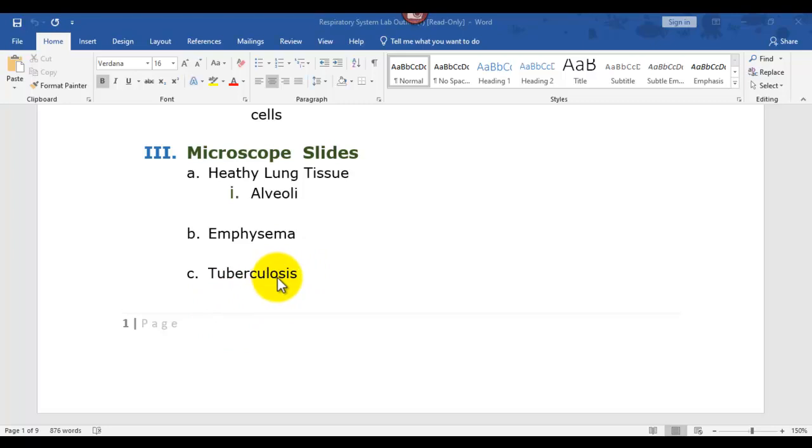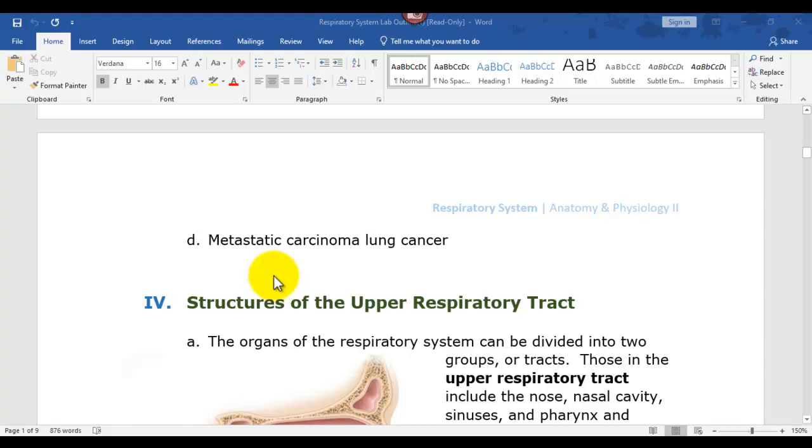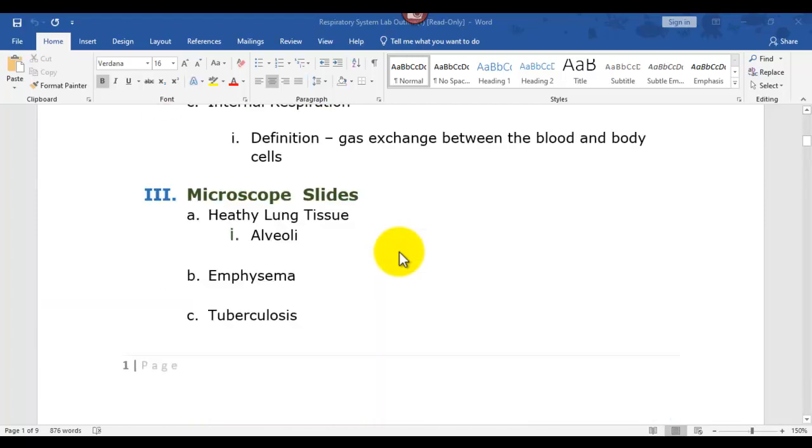And then metastatic carcinoma, lung cancer, is where a tumor, a mass division of cells, has moved into the lungs and to the alveoli. So I'll start here first.